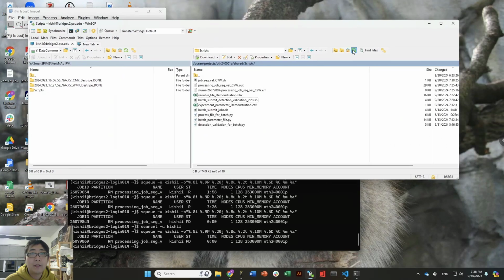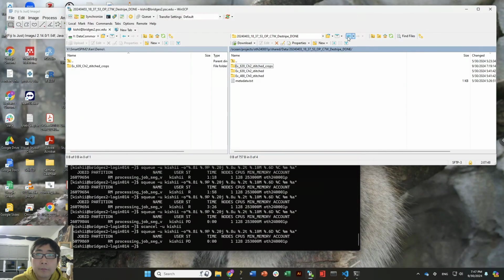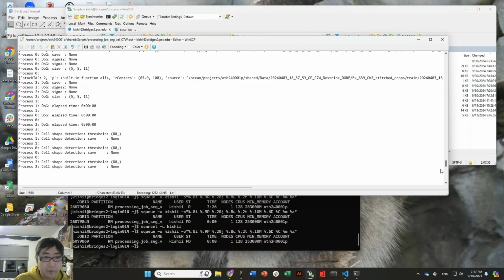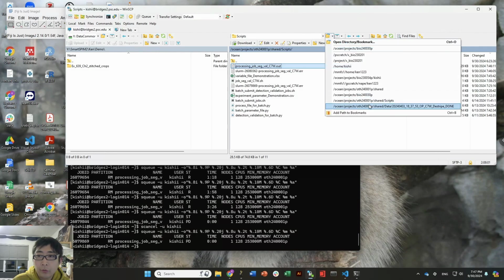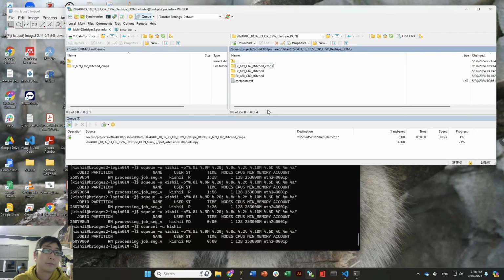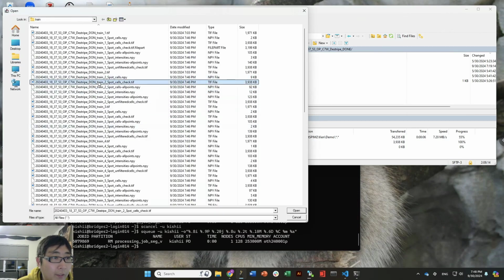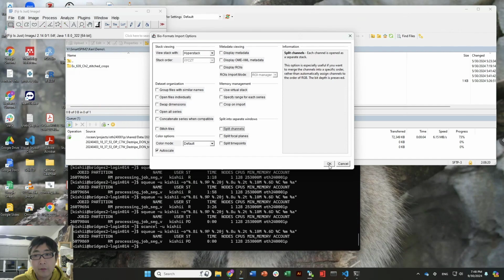So again, this may take a while. So we wait. Okay, so once the script is done, you can check that in your file. You go back to your folder and then download your files again to examine. Once that's done, you can go and open it in ImageJ again. And then you can open these files.